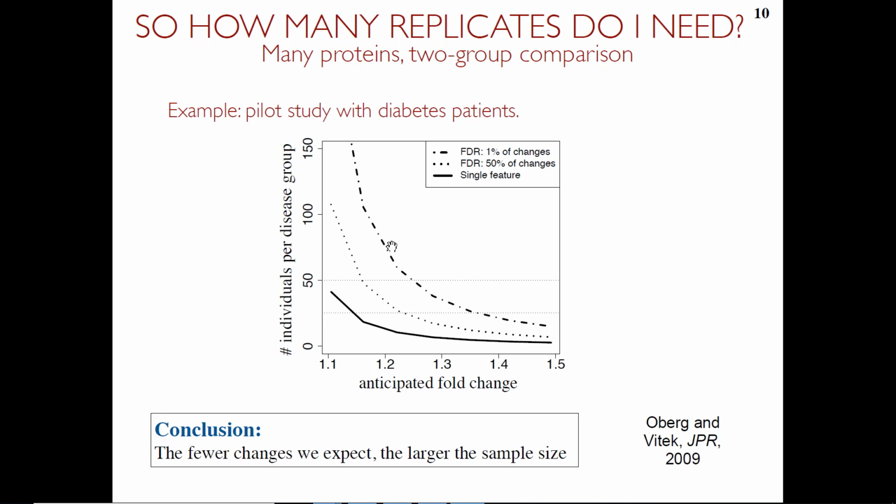We had a conversation with one of you yesterday. So how can we filter things out? For example, if you know that some proteins, you don't really know what they are, you won't be able to annotate them reliably, you will not be able to follow up on them, just remove them upfront. This is part of your protocol, right? So you do it before you do the t-test and so on. But if you know that these proteins or features or peptides won't be interesting for you downstream, don't include them in the study because it will help you gain power.